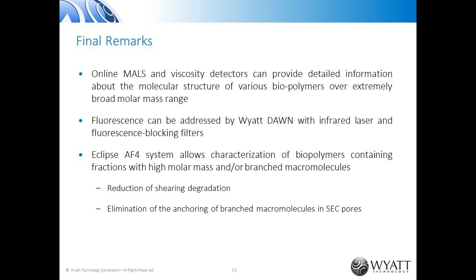Would you recommend analyzing cellulose in its native form or after derivatization? Yeah, this is a very nice question. Of course, the tendency is not to treat the polymer that much before analysis, because any derivatization brings a certain possibility of changing that polymer because we change the structure. On the other hand, cellulose can be pretty difficult to dissolve, even if we use strong organic solvents like DMSO or DMAc. And sometimes we may not be able to dissolve it properly.